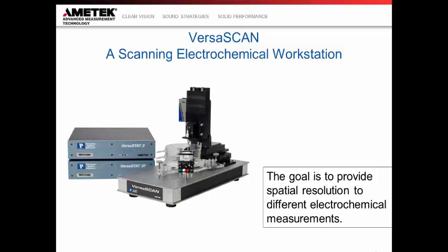Princeton Applied Research's offering is named VersaSCAN. It is a scanning electrochemical workstation. We see a picture of this here that's got the electrochemical base, an optical table that the motors and stages are mounted to. Then a picture of some measurement electronics. Here are potentiostats, the interface of the movement of the probe from the stages and the motors with the electrochemical measurements from our potentiostats and lock-in amplifiers that work with the probes to provide spatial resolution to a series of different types of electrochemical measurements.